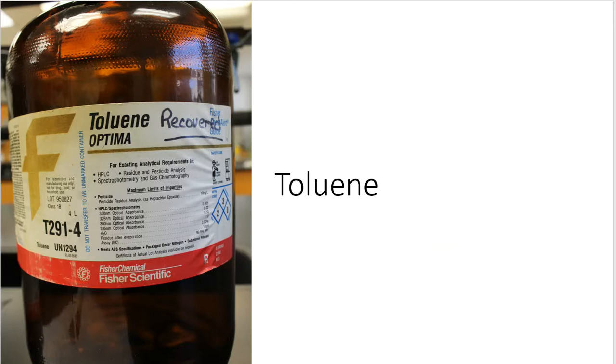The next one they want me to use is toluene. Now, this one you probably don't know, but if you look at the ending, you maybe could get an idea of what this structure is going to be. So this one you might need to look up as well, but here is toluene, and that's also Fisher Scientific. You can see our two companies that we gravitate toward. And the lot number here is 950627.